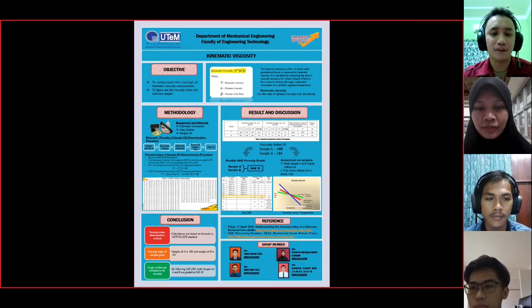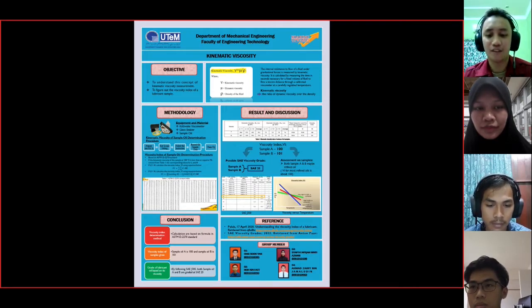After that, we record the oil sample data, then use the up arrow key to toggle the display from 40 degrees Celsius to 100 degrees Celsius. We follow the tilt instruction again when it is prompted on the display, and after that the display will show the viscosity of the oil sample.